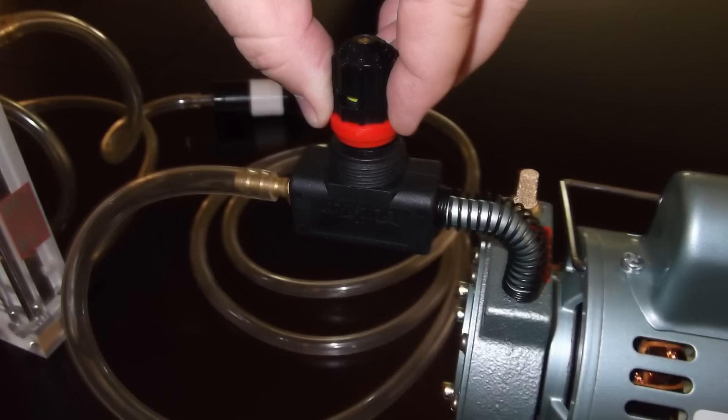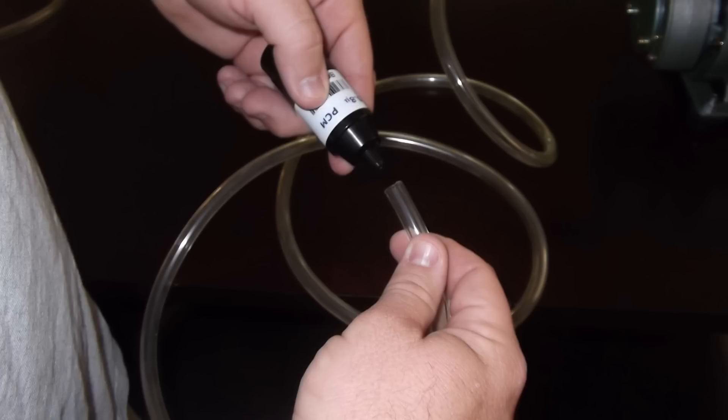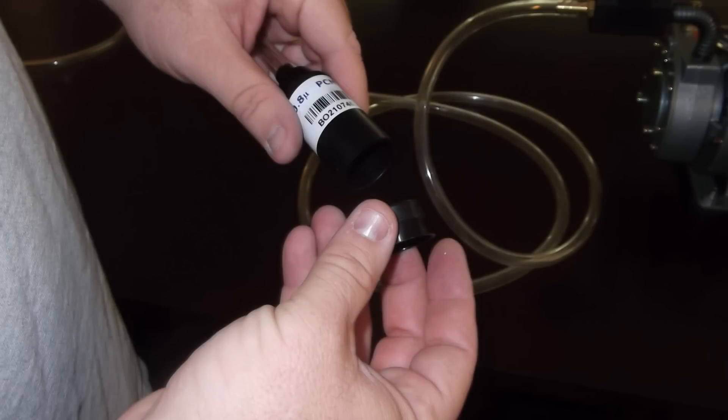Before turning the pump off, engage the locking portion of the flow valve by pushing the red ring down until it clicks. Then disconnect the rotometer, primary calibrator, and the calibration media. Now connect the actual sampling media to the tubing from the flow valve and you are ready to begin sampling.